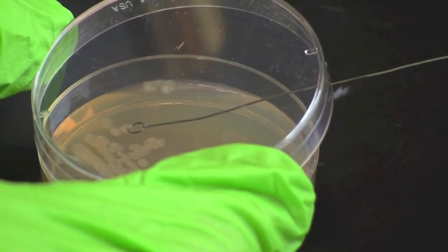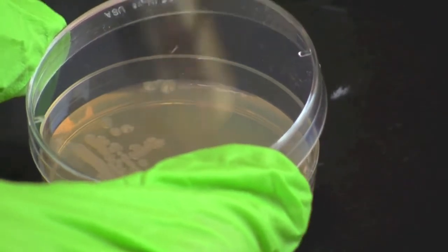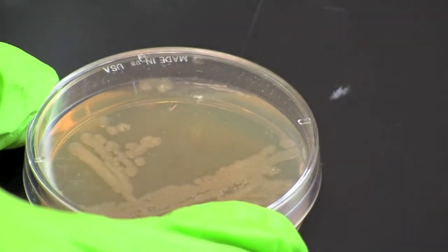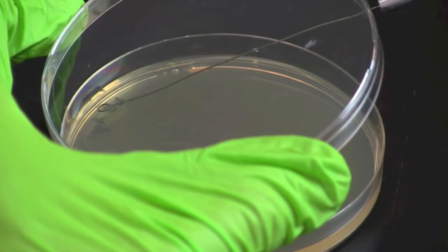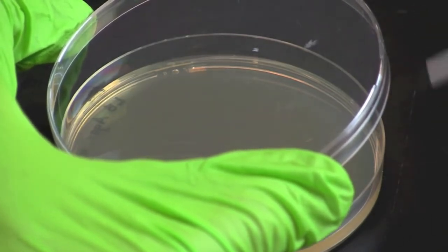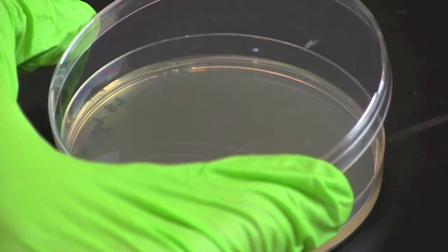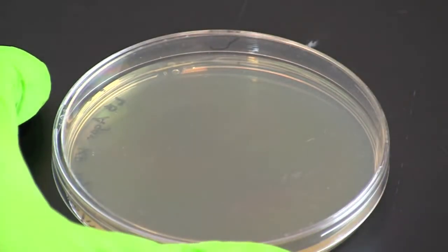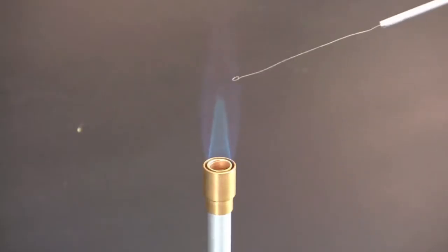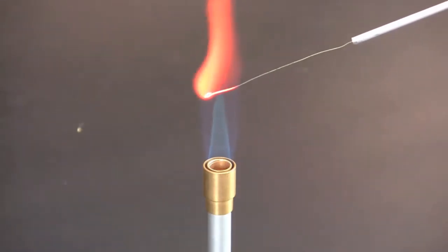Gently scrape a colony from the surface of the plate so that it collects on the loop. Transfer the bacteria to your LB agar plate and gently rub the loop back and forth across the top left corner of the plate about ten times. Stay in the top left quadrant and do not break the surface of the agar. When finished, flame the loop.